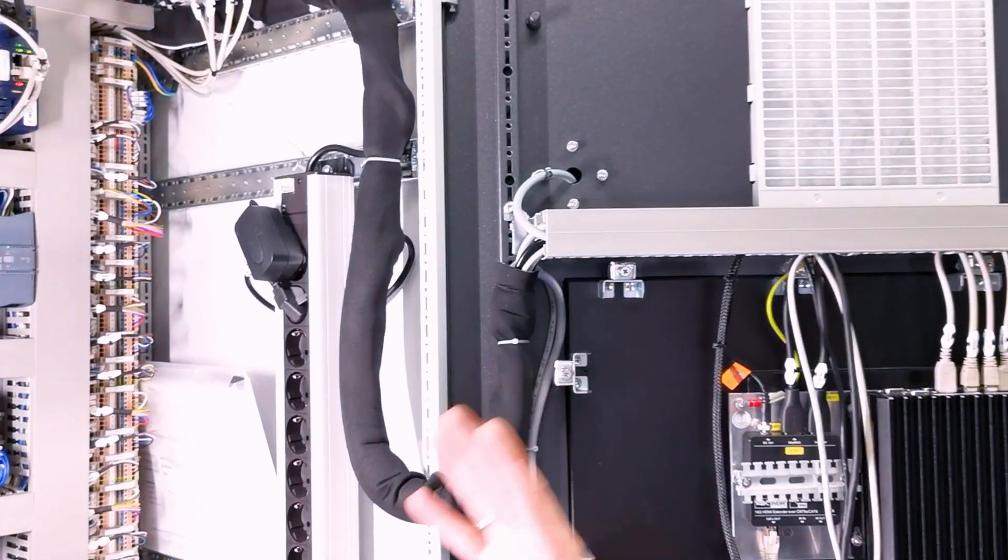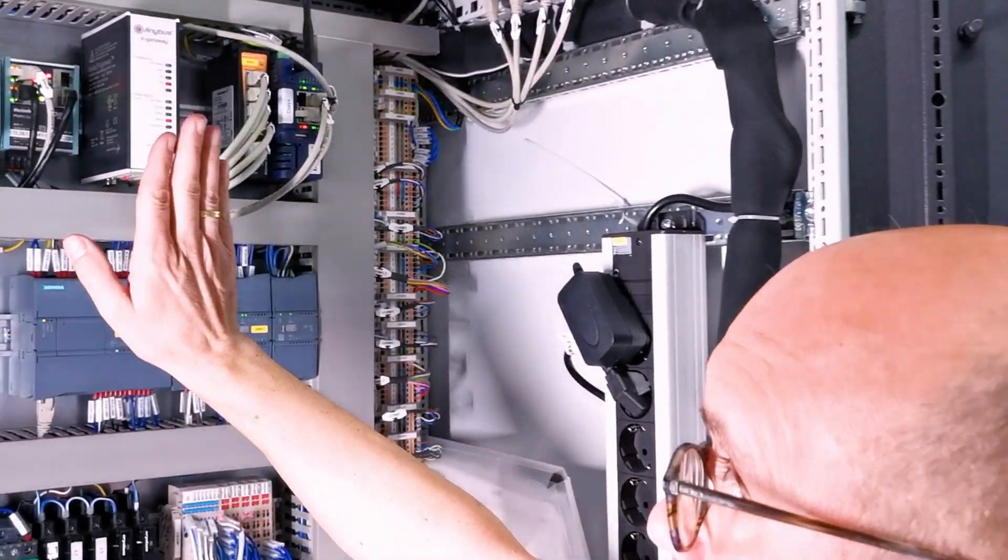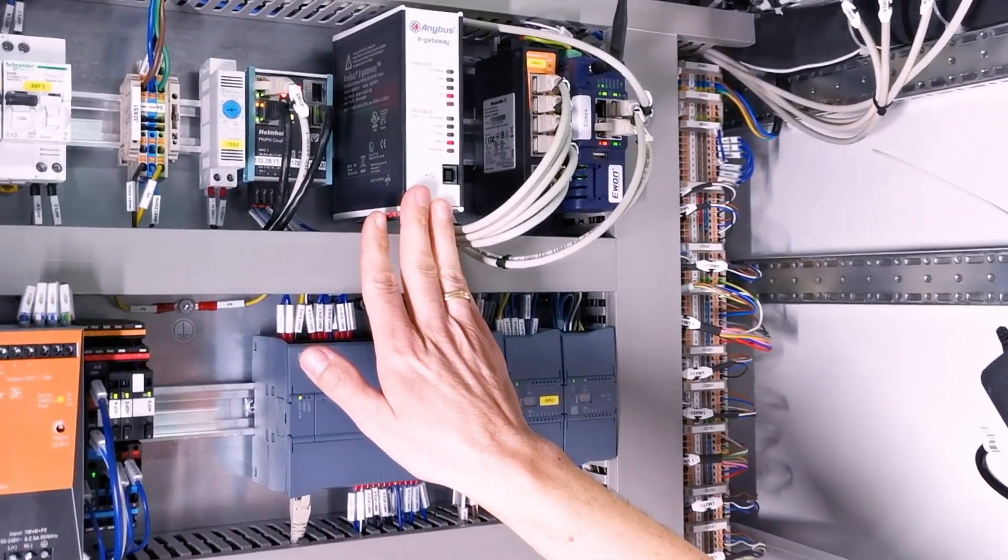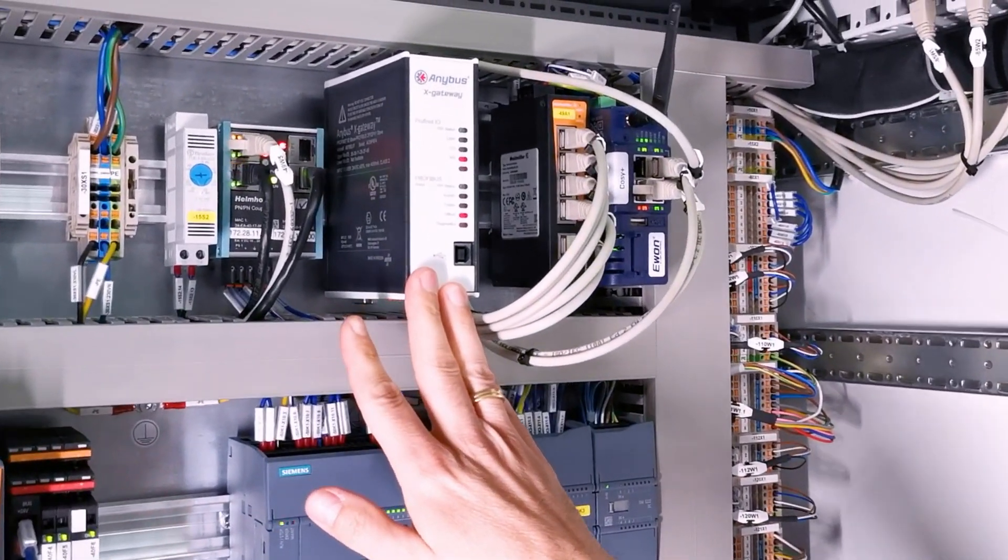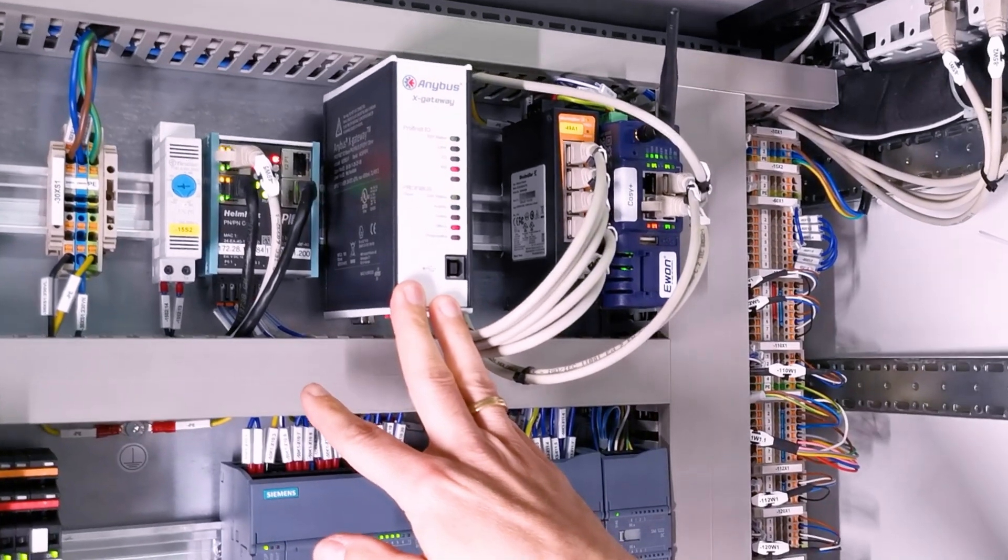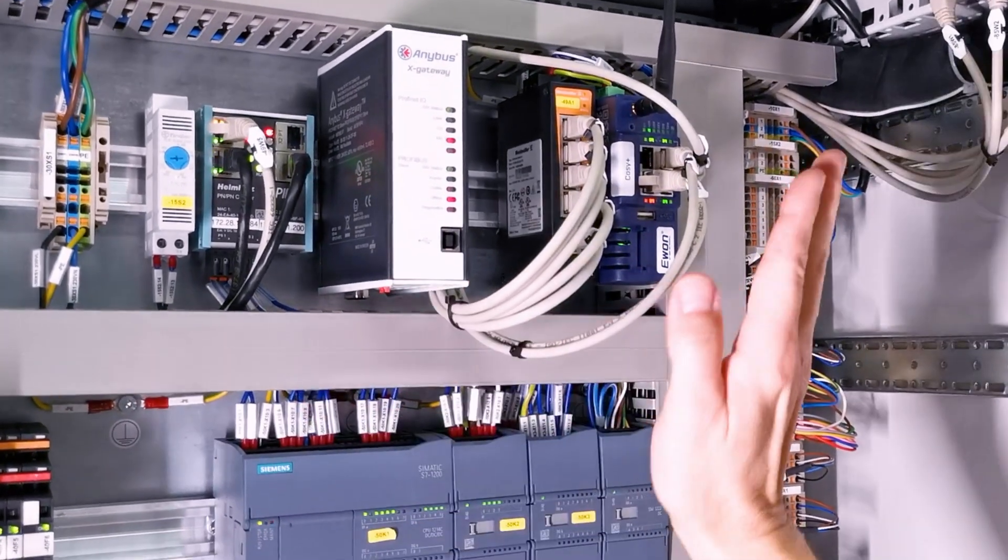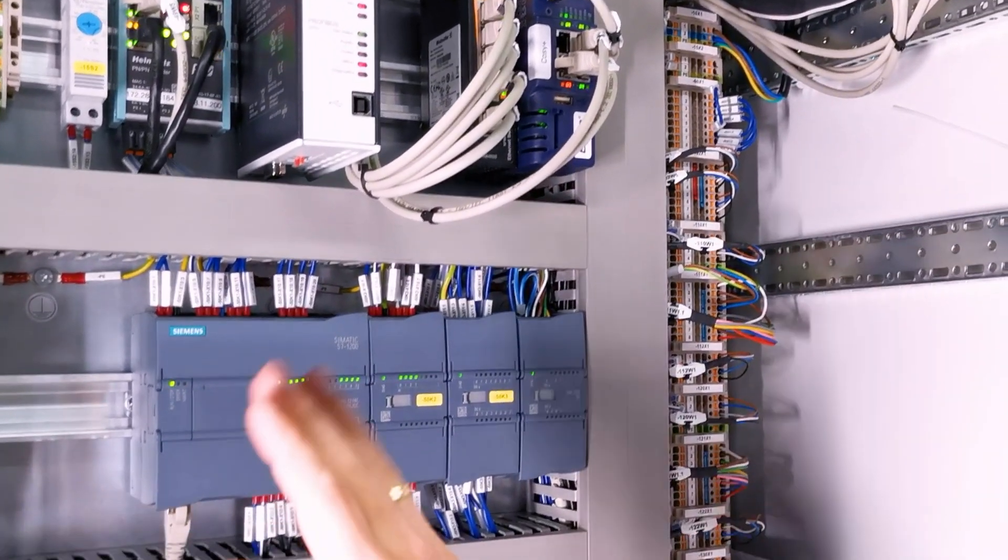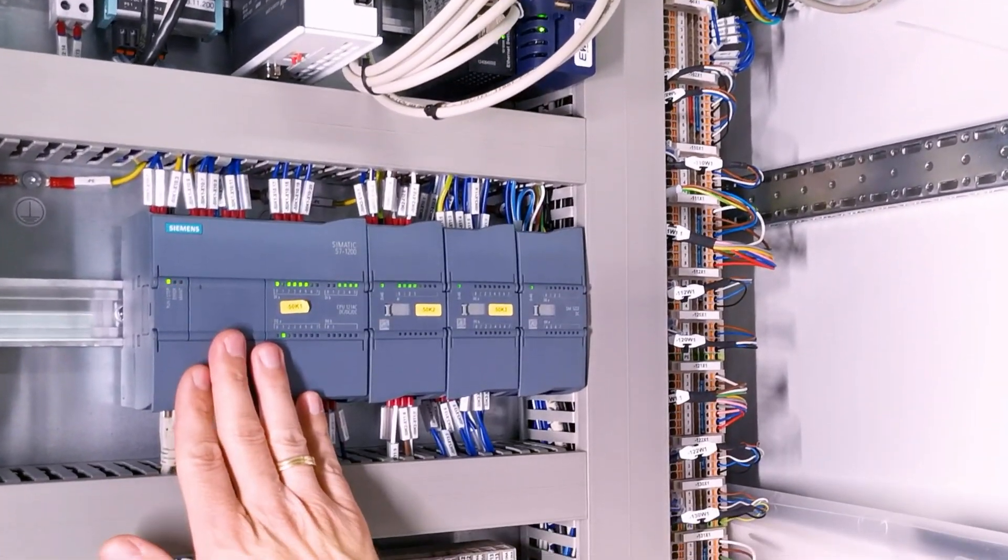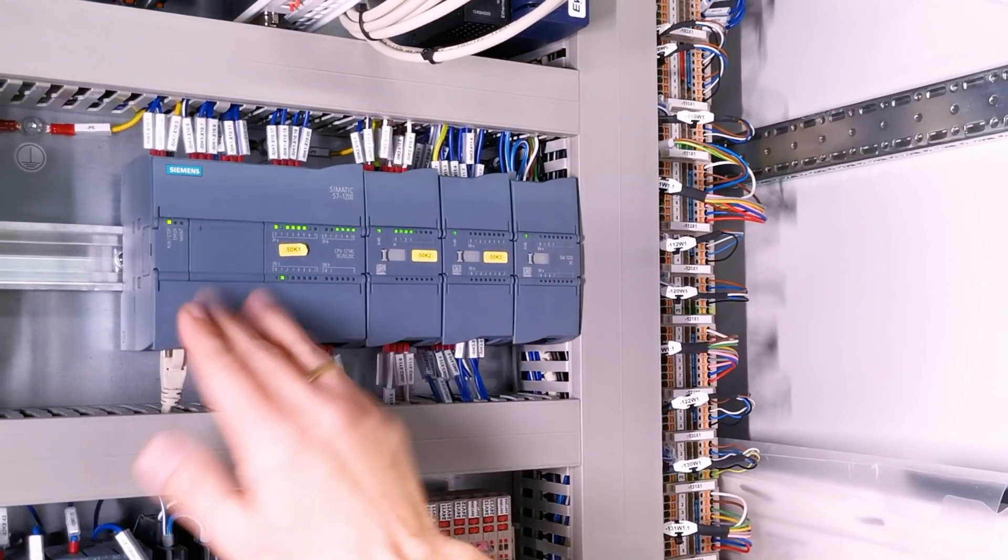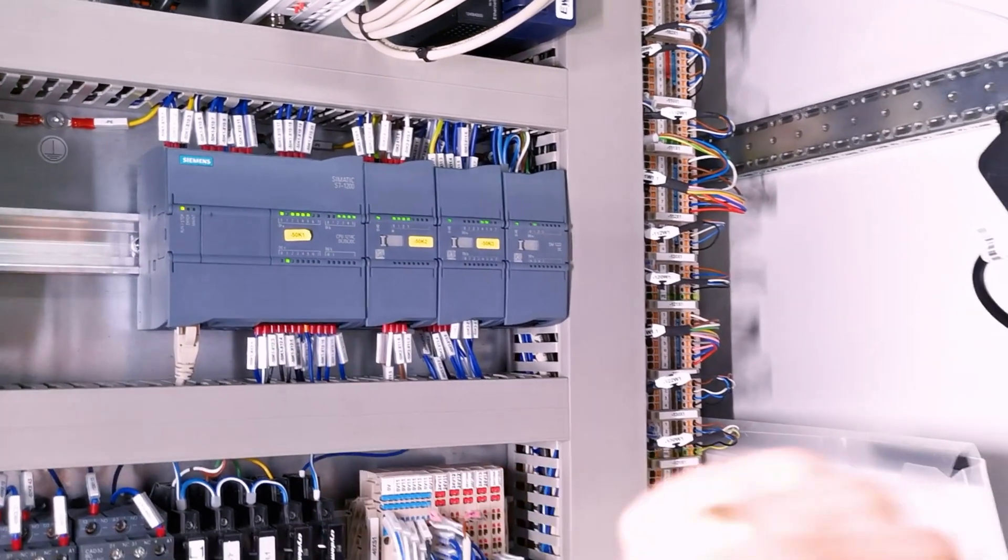I just want to point out the individual field bus couplers. Different protocols, different amounts of field bus couplers are possible, and also the remote access. Here, as an example for the industrial grade, the Siemens PLC.